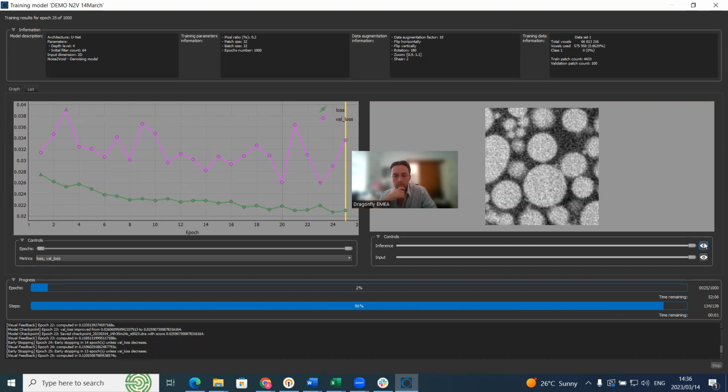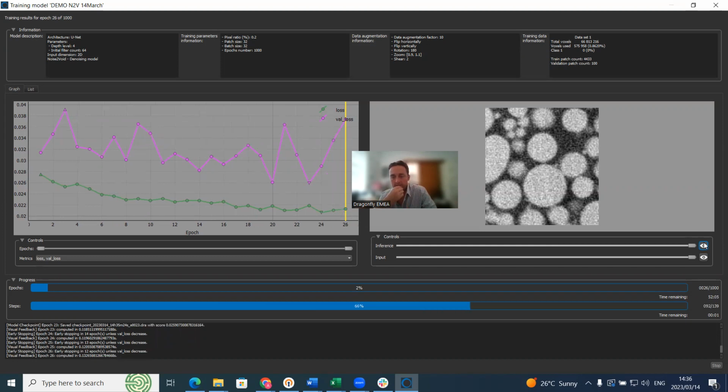So with all deep learning models, the more data you provide in, the better it becomes. This is a small test data for training. So if you provide real big data, it will take longer and it won't do early stopping, most likely.